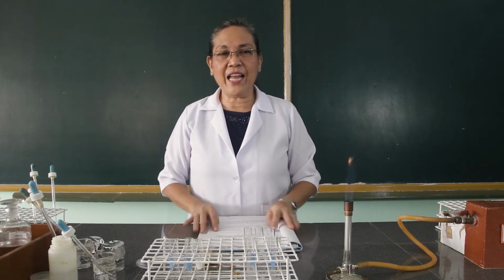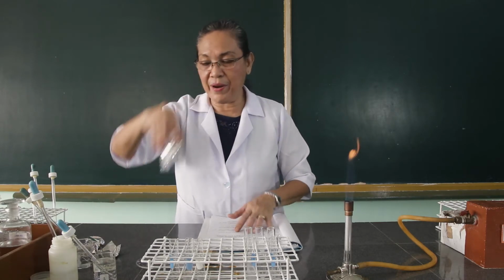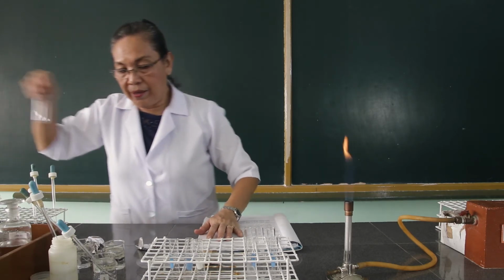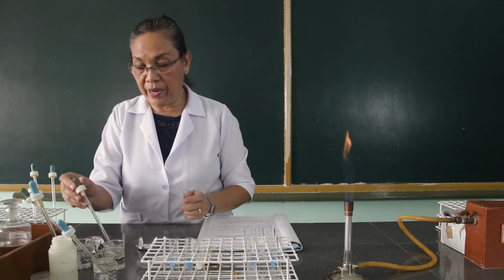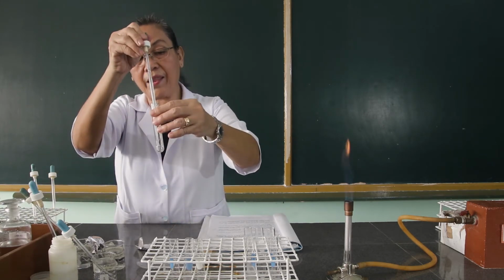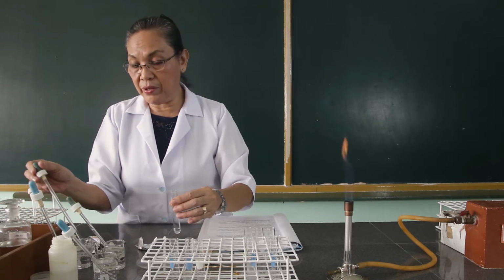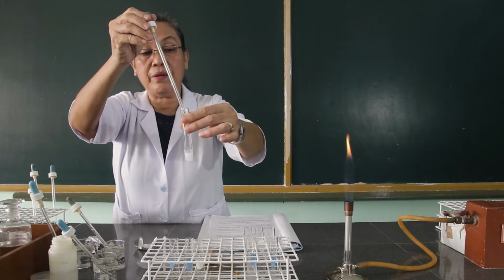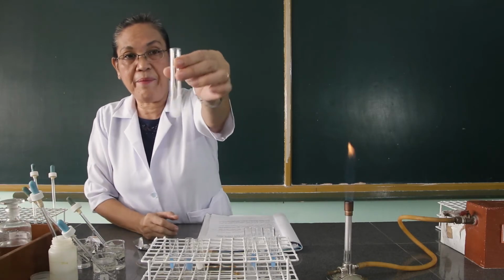Let's go to the analysis of the strontium ion. So we are going to use here the strontium chloride. Let's get 1 ml of the strontium chloride. One more. Then we are going to add ammonium carbonate solution. 4 drops. 1, 2, 3, 4. Observe what happens.